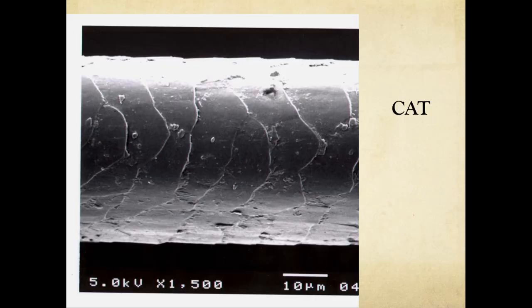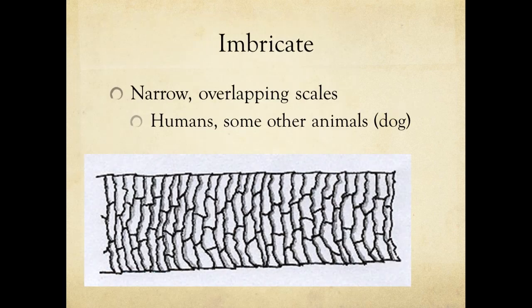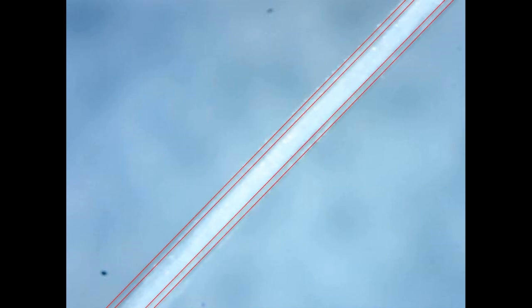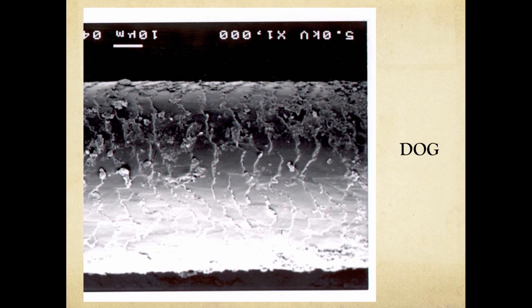This is a cat hair under the ProScope digital microscope. I want to draw your eye to the cuticle pattern along the outer layer of the hair. If you put this hair under a high-powered scanning electron microscope, the spinous cuticle pattern is clearly visible. The third major cuticle pattern is called imbricate, composed of narrow scales that look a little bit like stacked bricks. Humans and dogs have this cuticle pattern. This is a dog hair magnified using the ProScope microscope — the scales of the cuticle are outlined here. Under a scanning electron microscope, the imbricate pattern would be much clearer.